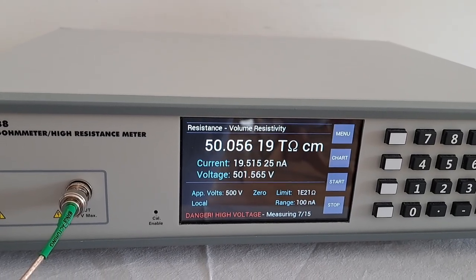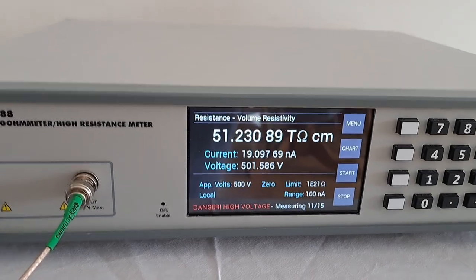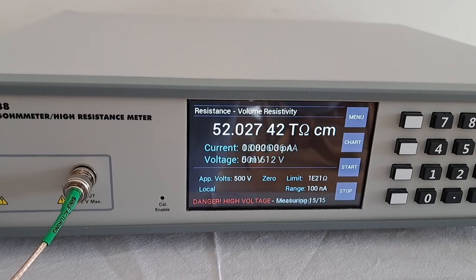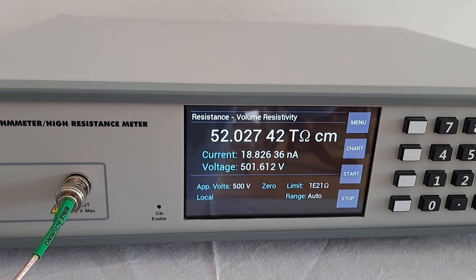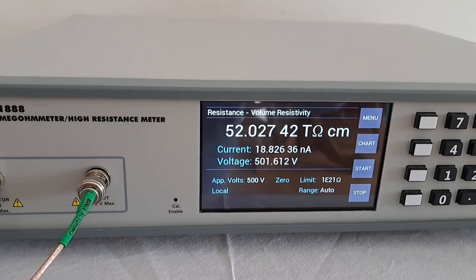In this particular case, normally the measurement would be for 60 seconds, but to reduce the test time I'm only doing a measurement for about 15 seconds. You can see that the volume resistivity is shown directly in the correct units — ohm centimeters — and that is it: a basic measurement of volume resistivity.